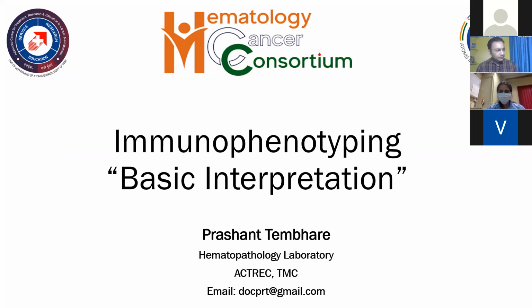So with this, we have a 1.5 hour session here, and for the first 45 minutes to 1 hour, I'm going to give a presentation on different topics related to the interpretation of flow cytometry, mostly focused on the hematology part. And then we are going to have a discussion. But I would be very happy if you can also ask me any question in between. You can stop me. I have no issue with that, and we can discuss that point there also. So we have some freedom in that regard. So I will start.